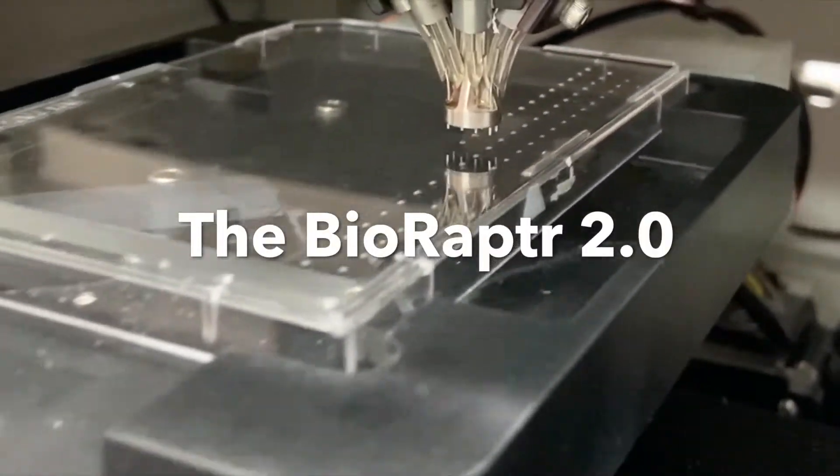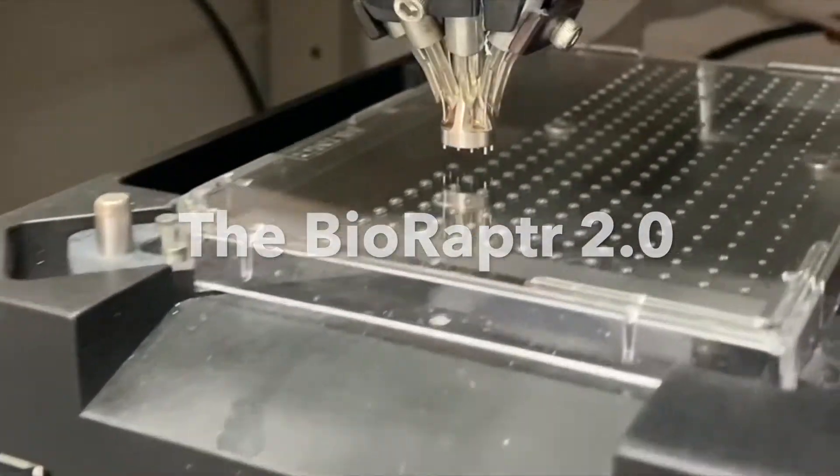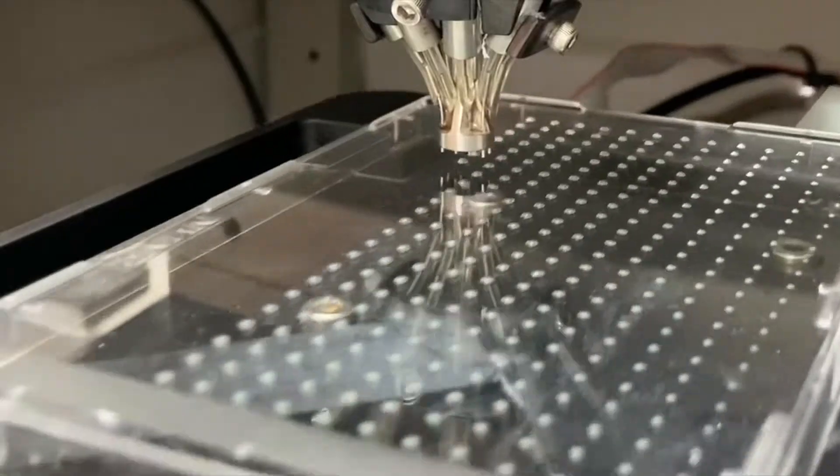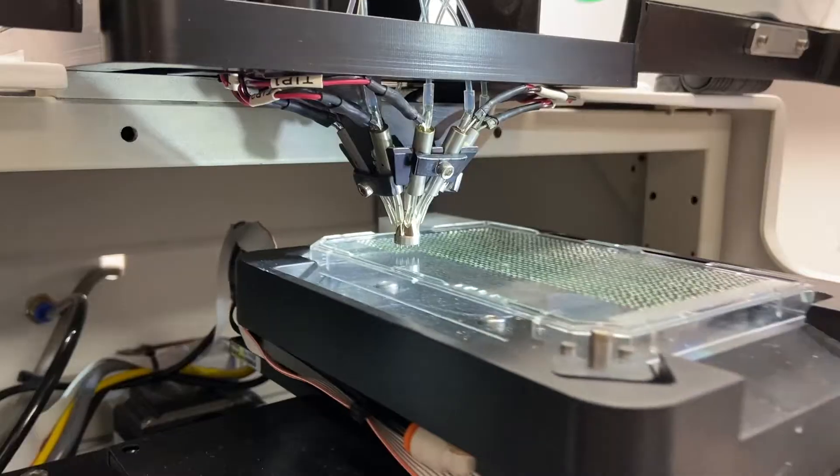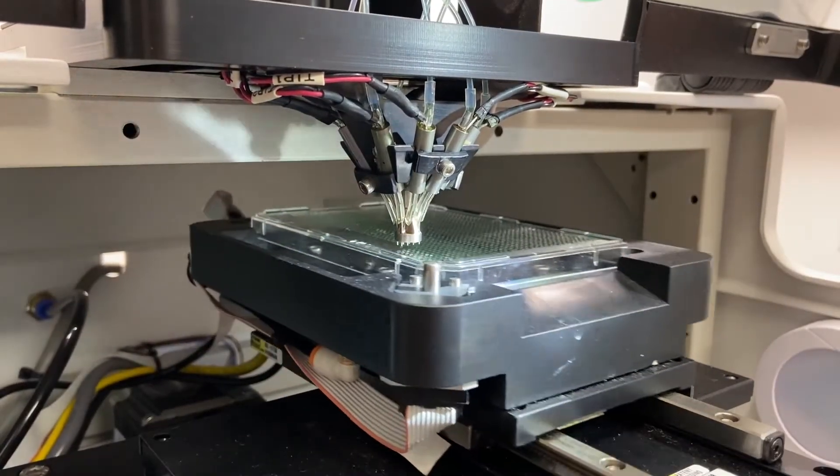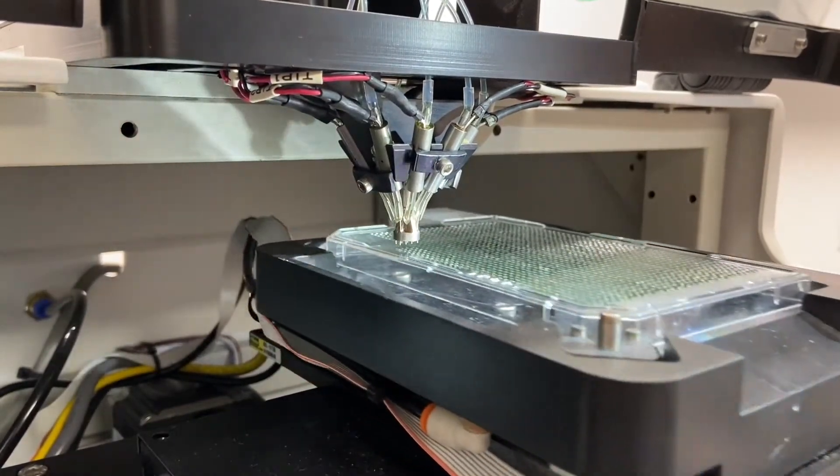The BioRaptor 2.0 FRD dispenser offers precise dispensing, dispense on the fly, and all the great features of the current system.